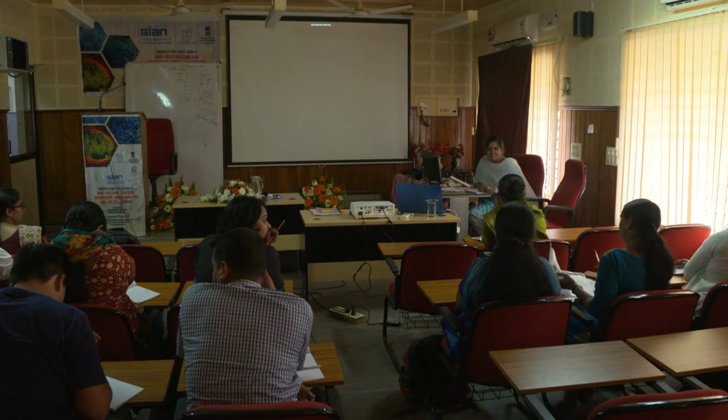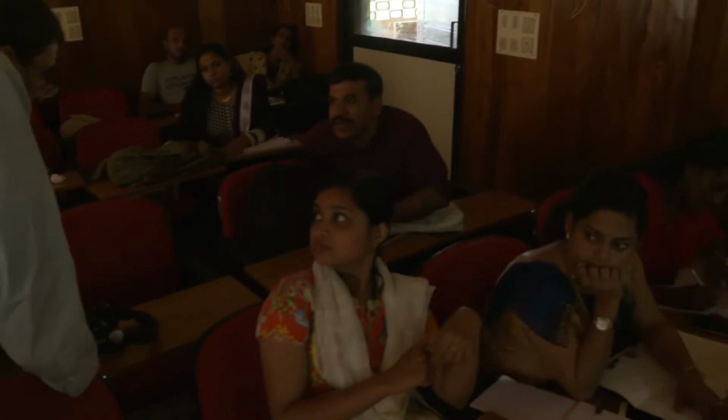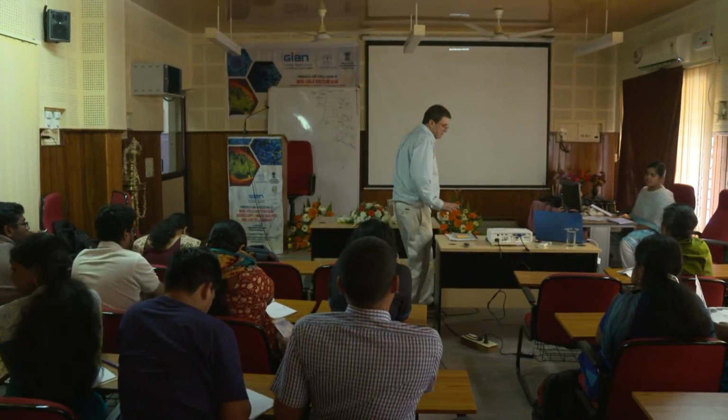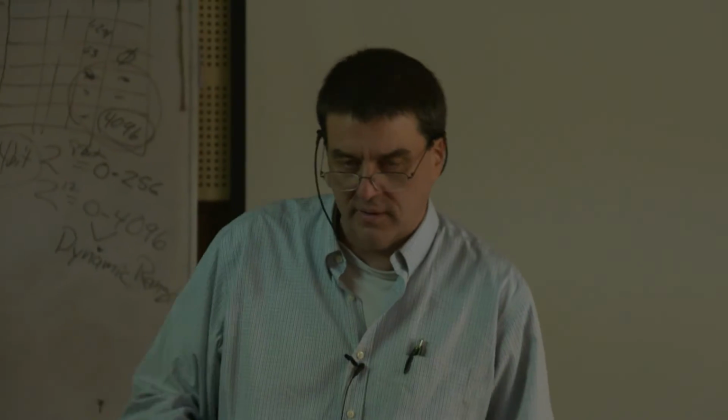All right? Yes? Why does the fluorescent microscope not give depth images compared to confocal, in depth Z-stack, as you told? So what's the difference between the two? Okay, we'll talk about that now, because it is a good question, and it is sort of a good intro when we start talking about confocal. We talked about wide field images, and the gentleman back here asked the question about what's the difference between that and confocal. Here's basically the difference.